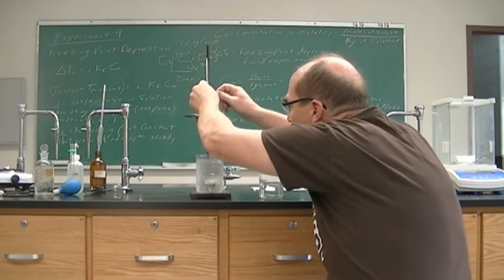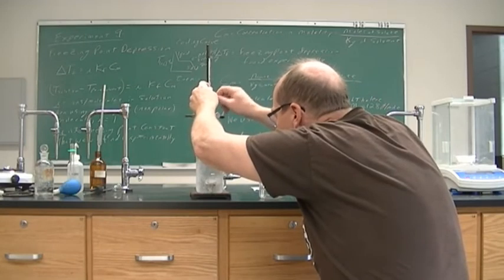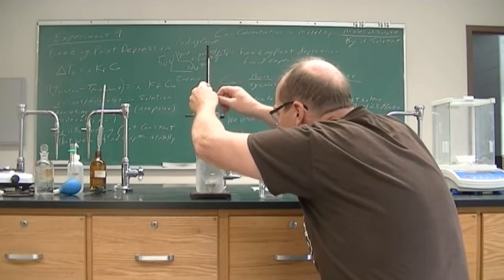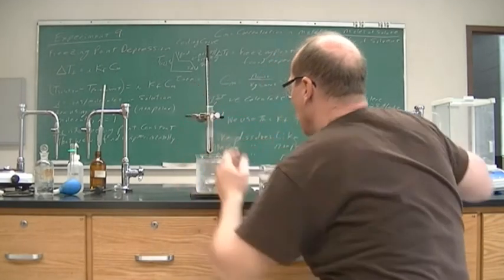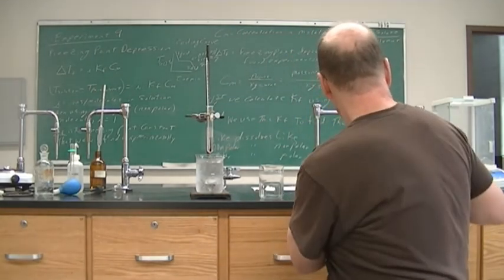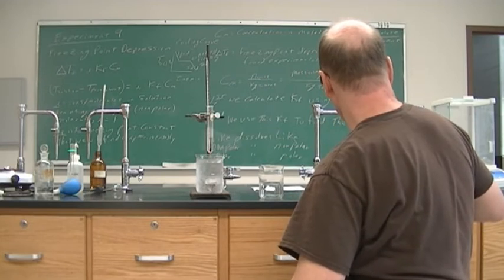All right, so we are at 2.5. All right, and now our temperature is 2.8. So, and that's when the last solid was melting. So 2.8 degrees Celsius is our temperature for the naphthalene.